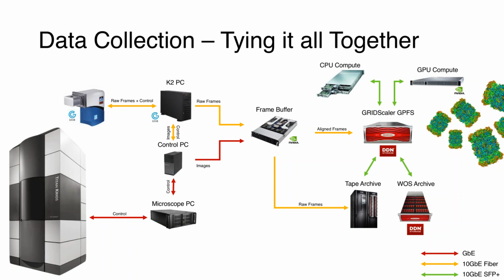Yeah, absolutely. I just want to add to that, a large reason why we buffer and why we have these extra things is because we are kind of retrofitting into buildings here. Our microscope facility is a quarter mile away from our compute infrastructure. So those kinds of things are something to take into account when you're designing this, absolutely.